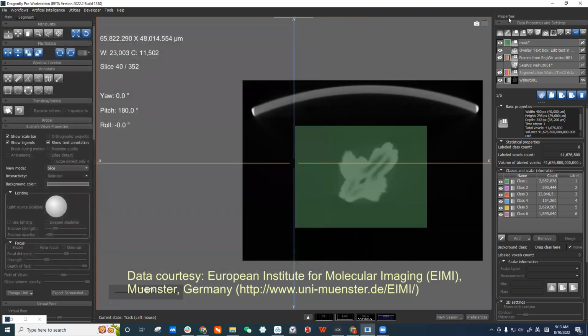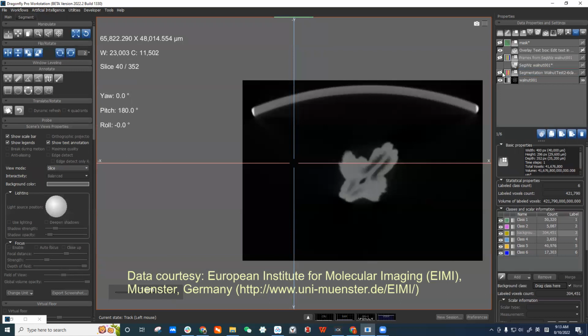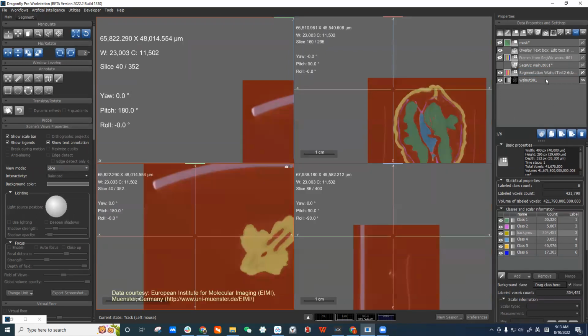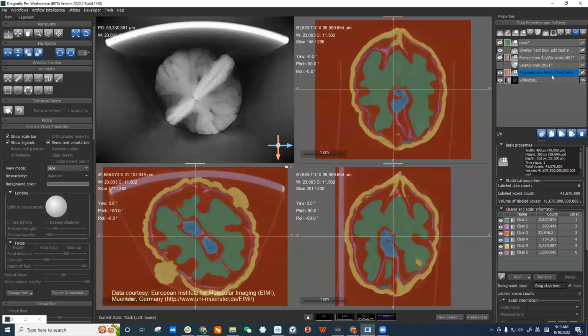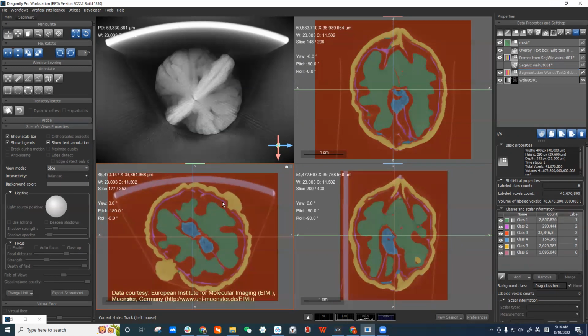The next tool is a bit difficult to find, which is here in this list. For example, if you have one fully segmented ROI from the model inference, and you probably have multiple fully segmented multi ROIs because you may use multiple models, and you want to compare the results, not the model evaluation we just did for some small regions.